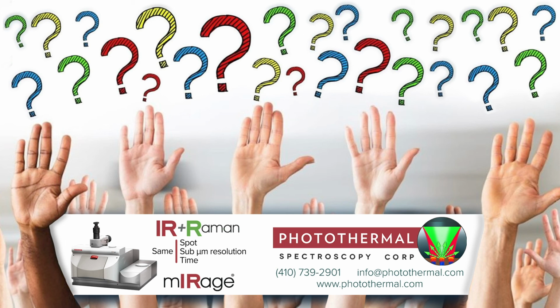And we use the lock-in amplifier to remove and extract that modulated signal, which contains the infrared information, whereas fluorescence is not modulated. Fluorescence only comes from the visible laser. So in that way, we very simply and easily remove the fluorescence, which unfortunately still impacts the Raman signal, but has zero impact now. Even if it's the worst fluorescing sample in the world, it will have absolutely zero impact when it comes to the infrared signal.